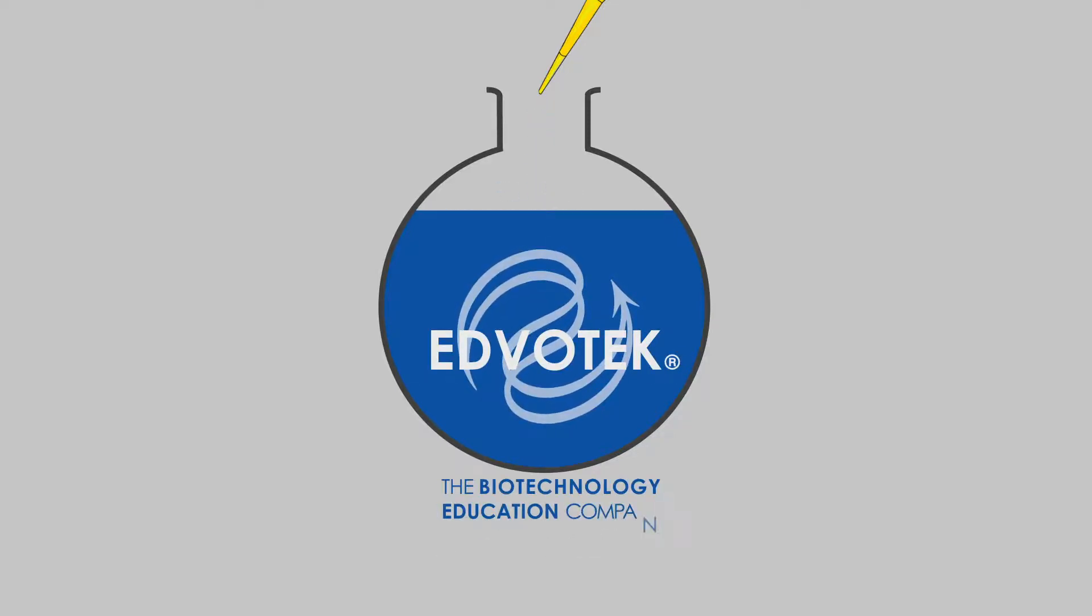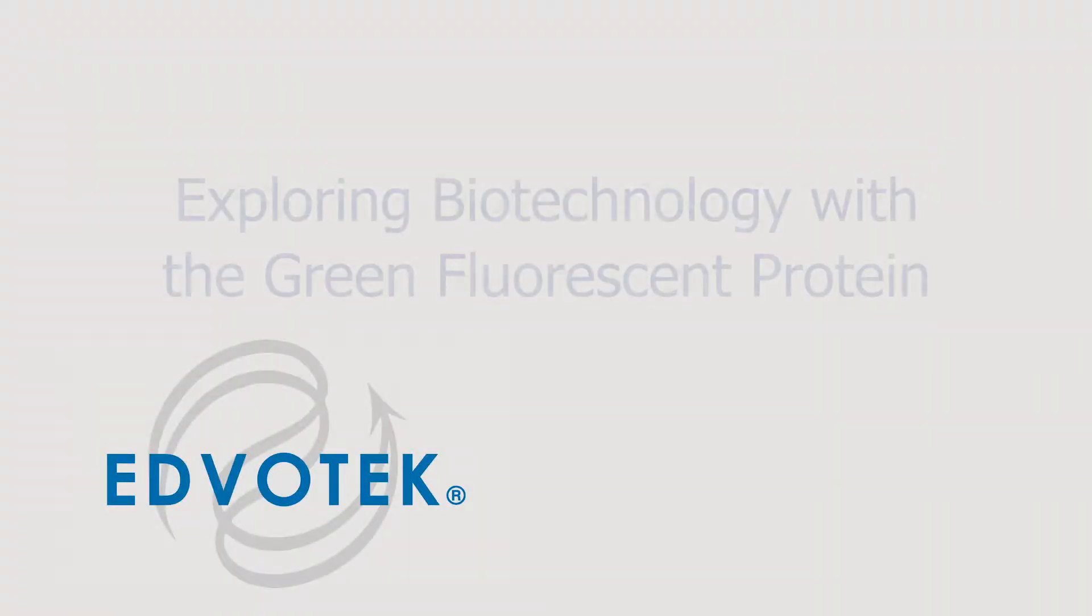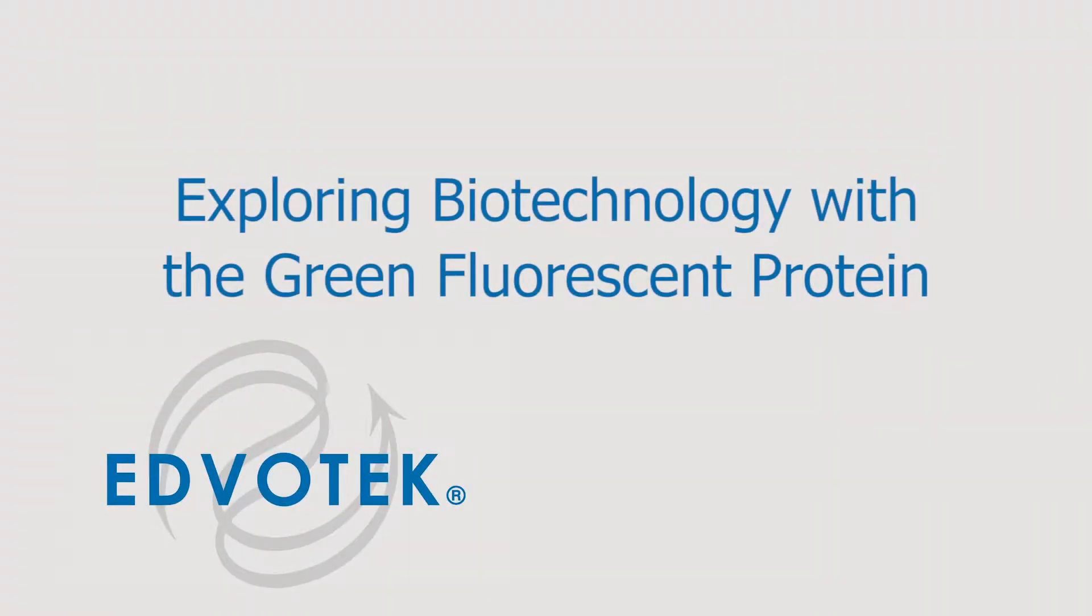Edvotech Instructional Videos presents Pre-Lab Preparations for Exploring Biotechnology with the Green Fluorescent Protein.